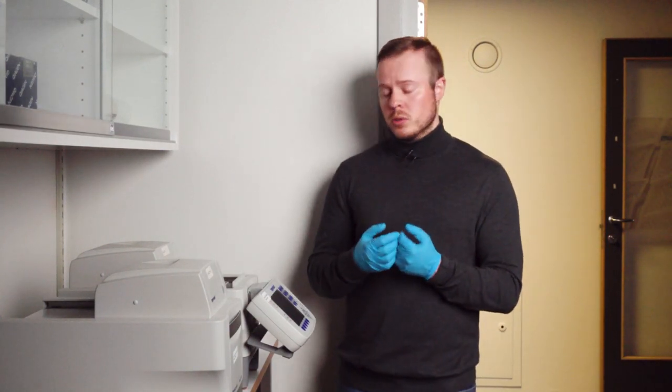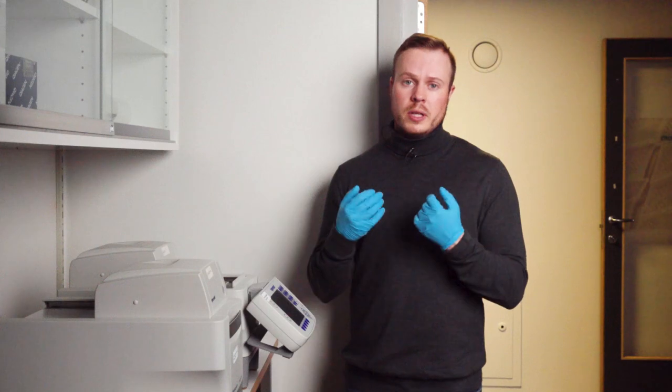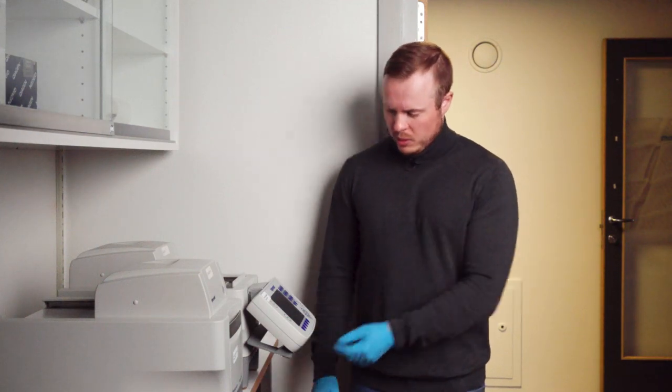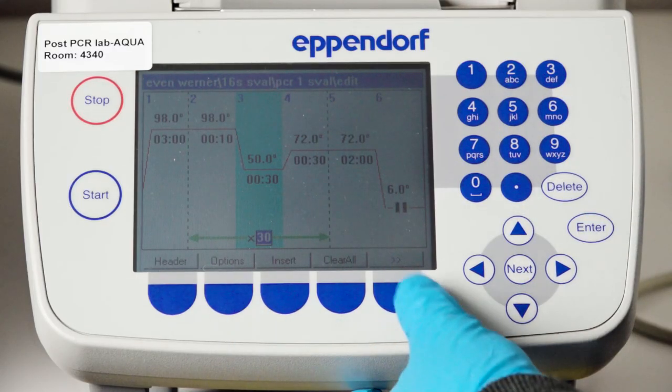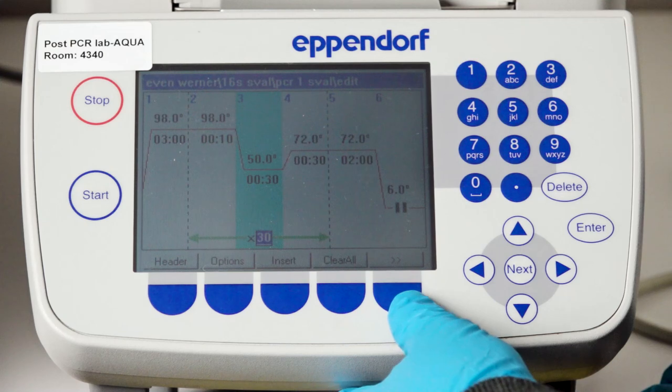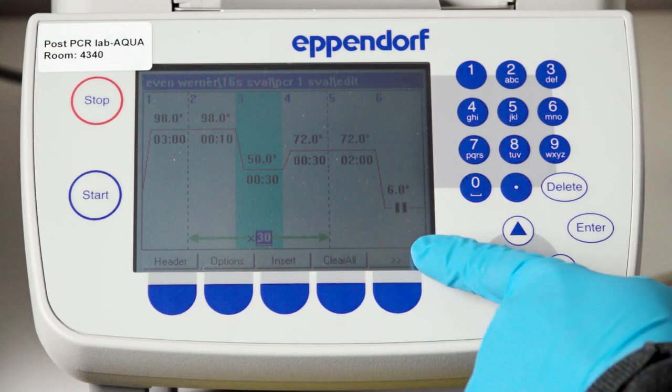The less cycles you can manage is always better because it doesn't make as many primer dimers. But sometimes you have samples with quite low amount of DNA and then you need to increase the cycles.